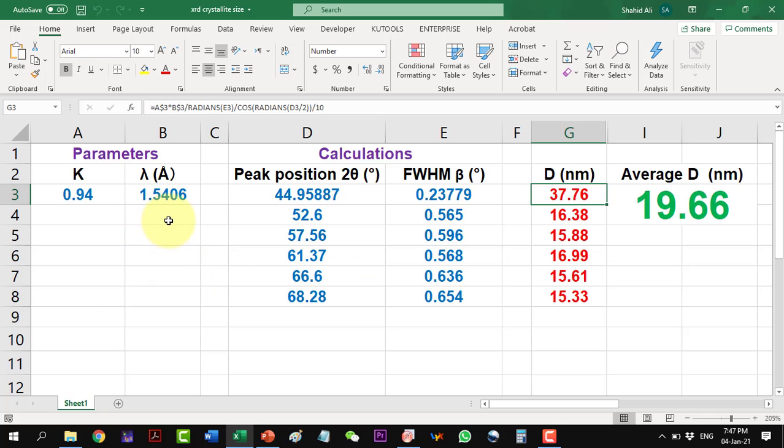In order to calculate the average, I will share with you this Excel file. Here we have the parameters: the Scherrer constant, then the X-ray value, our value of two theta, and the full width at half maximum. The calculation is here which is done as I did in the previous slide. Crystallite size comes out to be 37.76.